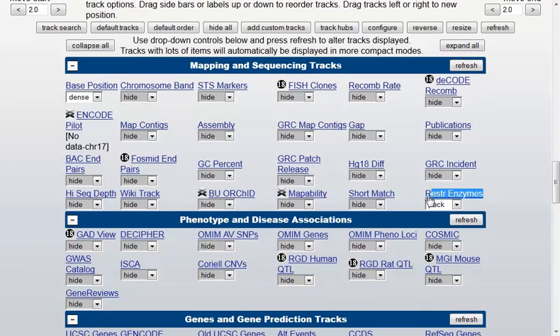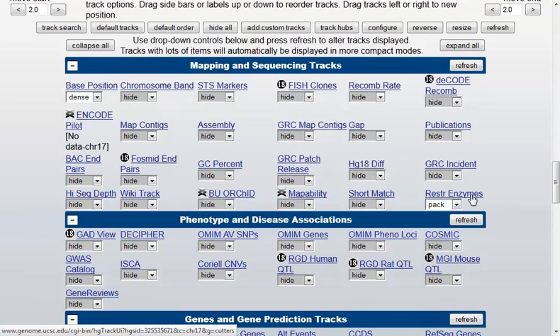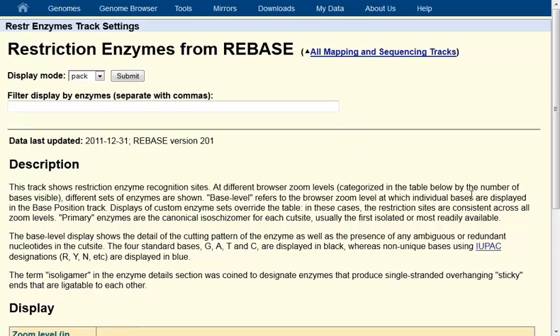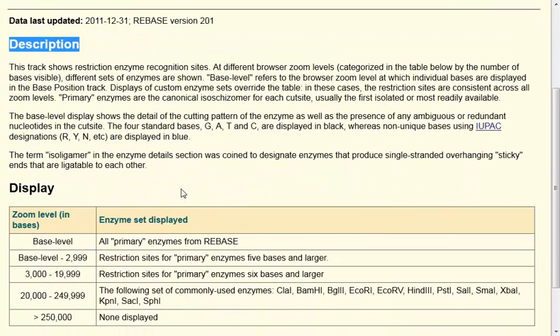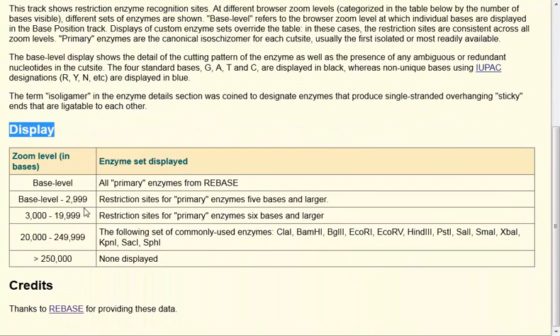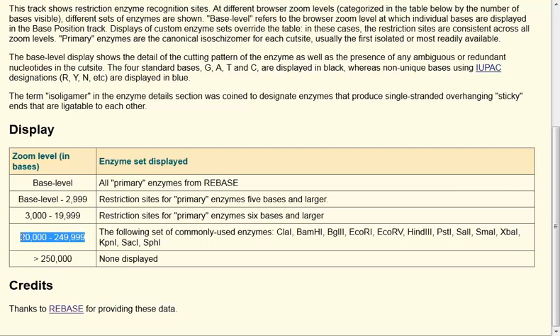Let's go back — this hyperlink is key to accessing more details about the Restriction Enzyme track and also possibly filters. If there's a filter associated with this track, you can find it from that hyperlink area. On the Restriction Enzyme track settings details page, the description area will tell you more about what's going on in this track, and they'll give you keys to the display. Also keep in mind that if you're in too large a region, you won't see any enzymes — you may need to zoom in. At different zoom levels, you'll get different subsets of enzyme sets displayed. This data comes from Rebase, which you can also access separately.